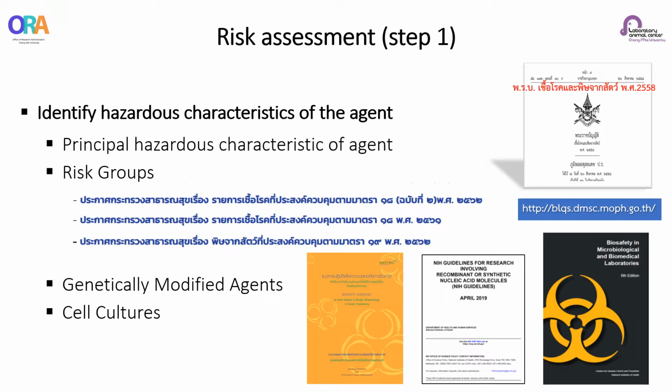For example, the risk assessment for an attenuated or less virulent form of an influenza virus will probably show that it can safely be handled at a lower biosafety level than would be required for a fully functional strain.